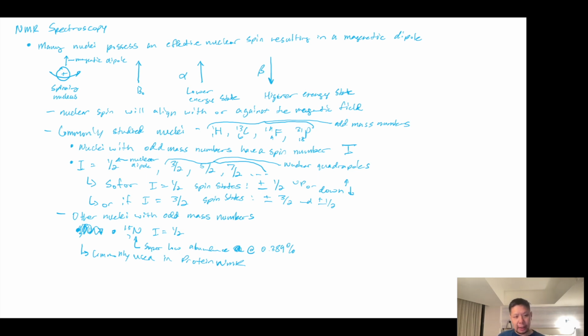And so when we include this nitrogen 15 ammonium chloride in the growth medium, the bacteria will eat that, and it will incorporate the nitrogen 15s into their peptide structure, their peptide backbone, and so now every single peptide bond in a protein will have nitrogen 15 labeled in it.